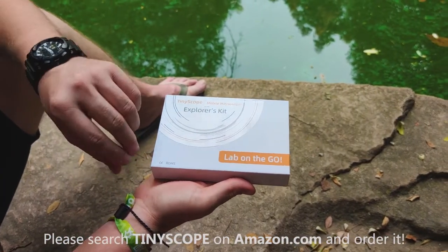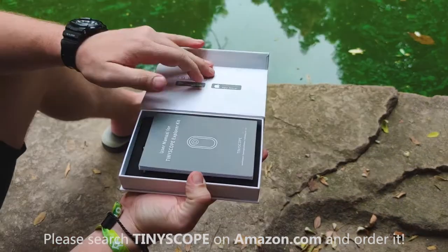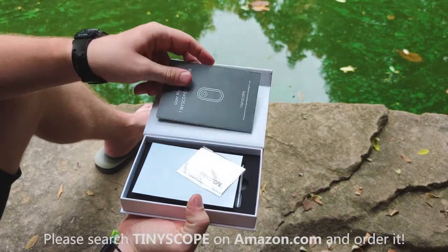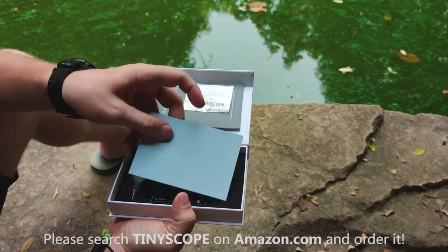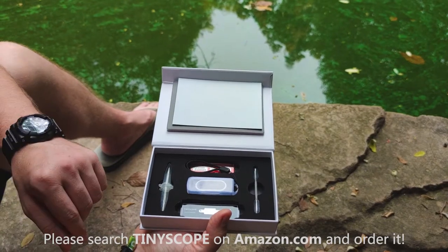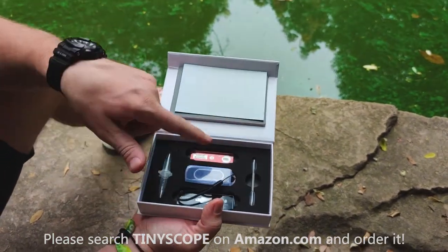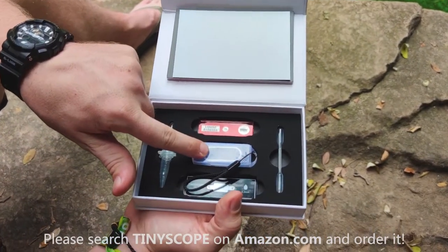Let's go ahead and open up the Explorer's Kit. Inside the box, the first thing you're gonna see is your manual — if you have any questions, the manual should answer them, otherwise ask on our Amazon page. Right here we've got a little viewing plate, black on one side and white on the other. In the box you can also see your liquid sampling setup, and the original slides that come with every Tiny Scope — your prepared sample slides.